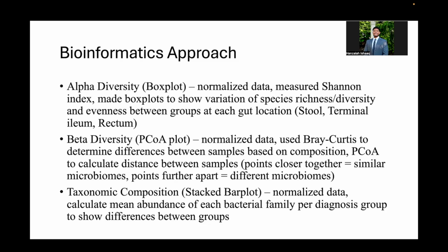Lastly, we're going to be plotting the taxonomic composition using a stacked bar plot. We're going to calculate the mean abundance of each bacterial family per diagnosis group to show the differences between the groups.